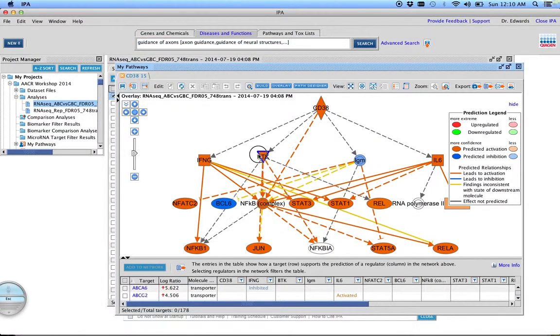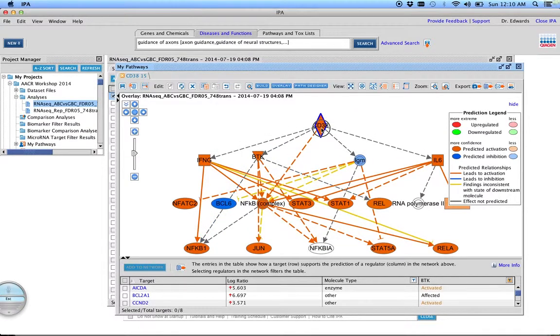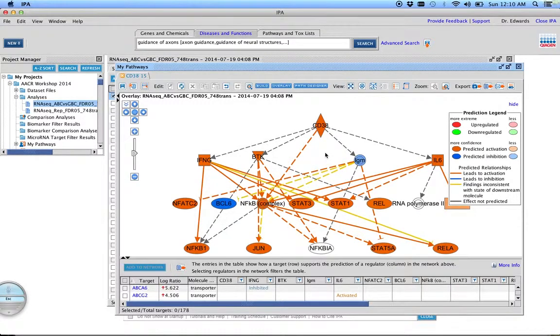And where is it? It's CD38 right up on top. So again, even its downstream or upstream regulators that it interacts with also are predicted to be going up. So something's going on. Even though we're trying to suppress this, and if you actually look this up, this makes sense as far as being related to B-cell lymphoma. So even though its expression is repressed, for some reason its activity is going up, and that's exactly what you look for.